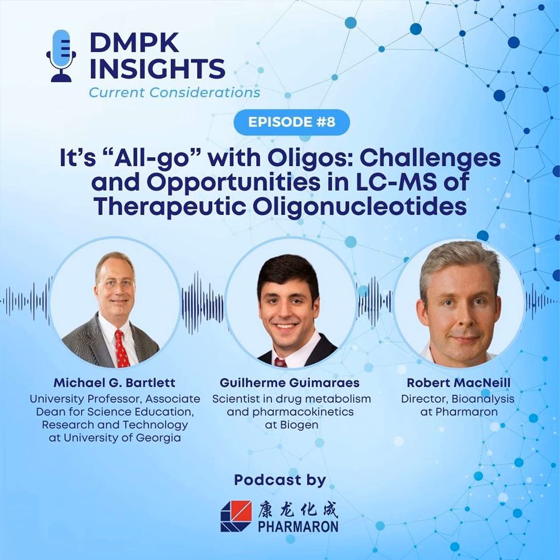I think Dr. Bartlett nailed it. Hit all the points. It's very dependent on your application, and the only other thing to consider, in my opinion, is that if you go the capture strand route, it's shown that you have less background, right? It's very specific. You're able to wash your sample during preparation and elute in nearly neat solution conditions, as opposed to some of the other ones. They're also clean alternatives as well, but it does seem that there's some literature out there suggesting that for the targeted hybridization extraction, you do get slightly cleaner samples, although SPE is not far behind, with liquid extraction, of course, being the worst performer out of the three in this aspect.